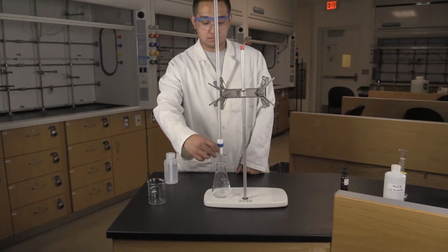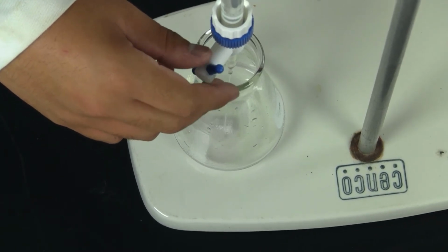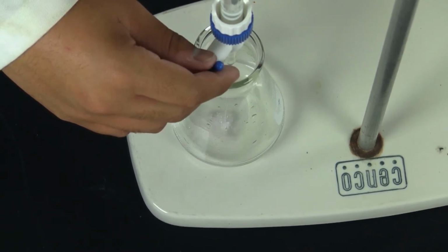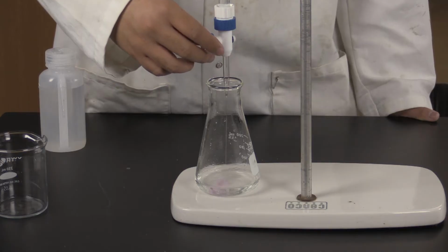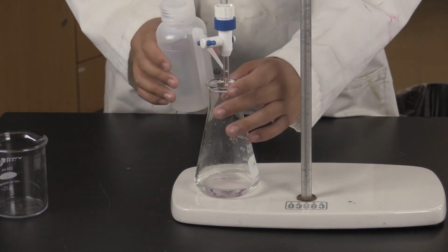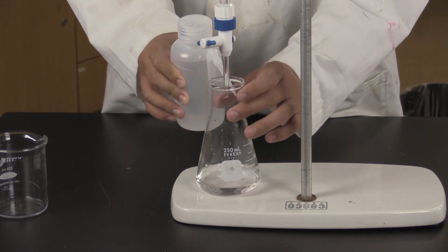Initially, titrations are slow going. The first trial will be the slowest. After the first trial, you will have enough information to speed up subsequent trials. Be careful, the endpoint can sneak up on you very quickly. Don't go past it. Initially, you will add larger quantities of solution, and as you get closer to the endpoint, you will begin to add smaller quantities. Keep your wash bottle filled with deionized water handy.